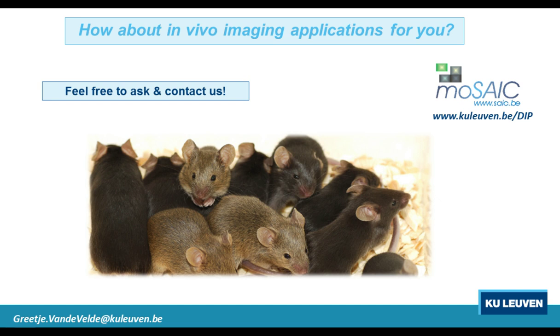All right, thank you. We have a second one coming up. Some people don't seem to have access to such scanners. How would they be able to get access to such imaging equipment? Well, try to convince your PIs to buy you one, but that's not so obvious. You should take a look around because there are many initiatives and many labs that may have a scanner. So regarding CT, I would recommend to check the dentists in your institution or in your city and bone people, because maybe they have a CT already there, because for that it's much longer a standard equipment, and they're probably happy to share their device with you.